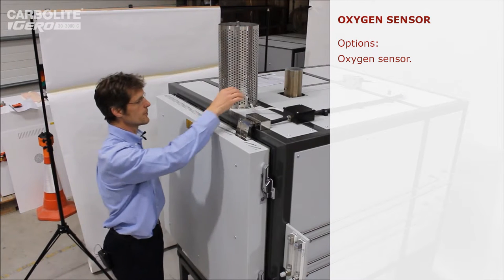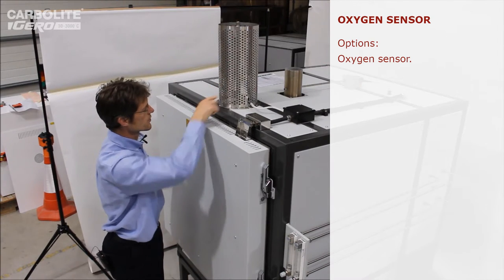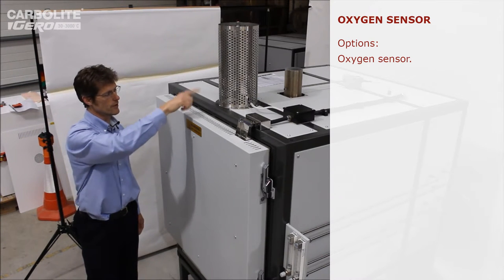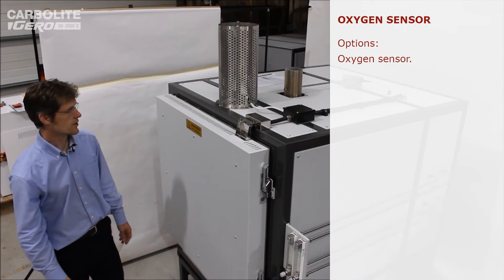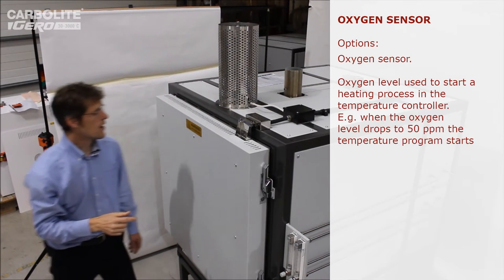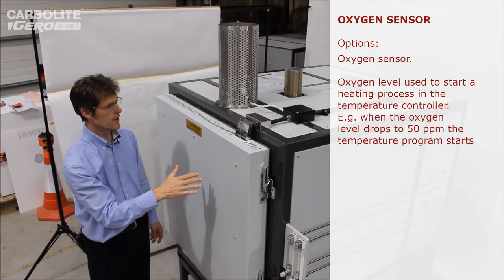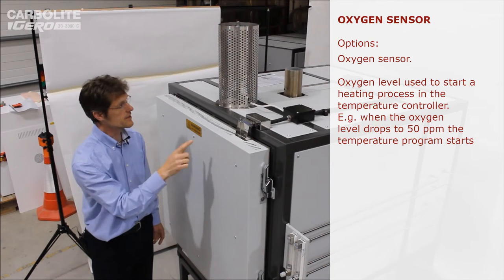Another optional extra on these HTMA ovens is an oxygen monitor, fitted here and connected into the exhaust pipe. It's capable of detecting the oxygen level in the exhaust independent of temperature, similar to the type used in car exhaust systems. This connects to the oven controller and can trigger different parts of the program — the purge gas comes on, and we wait until the oxygen level reaches the desired threshold, in this case 50 parts per million, before the heating cycle is triggered.